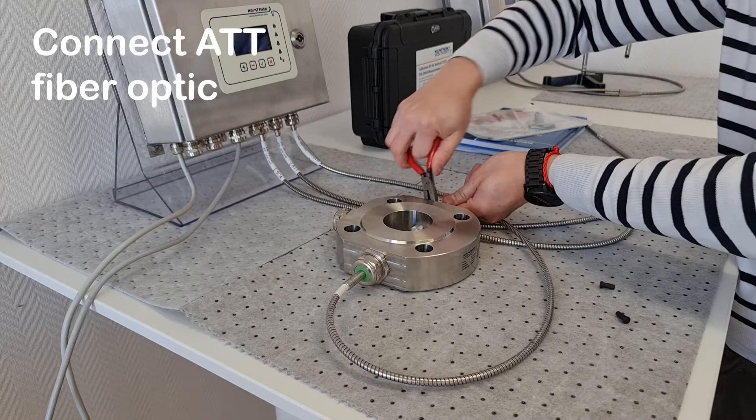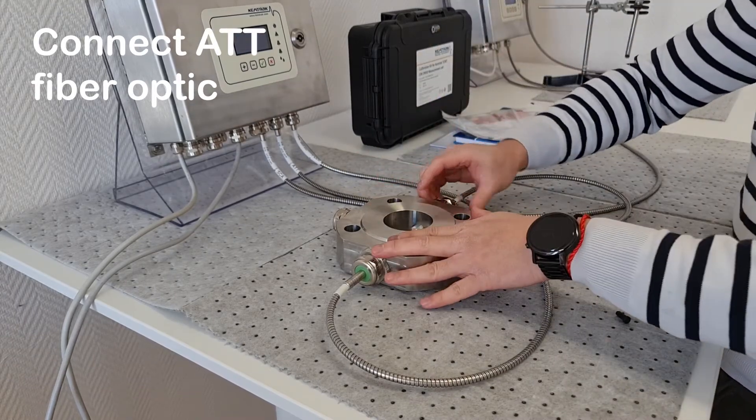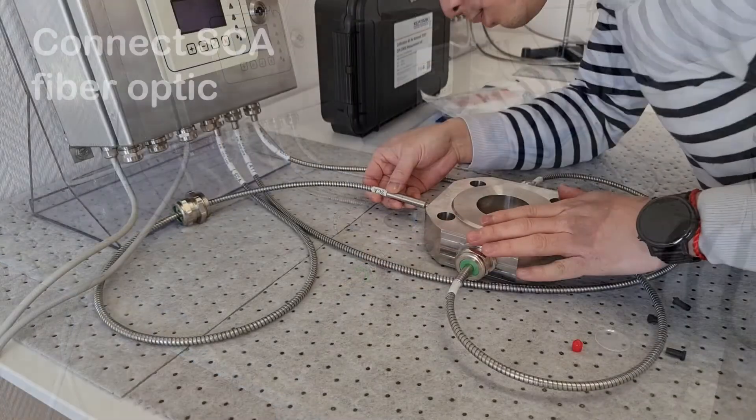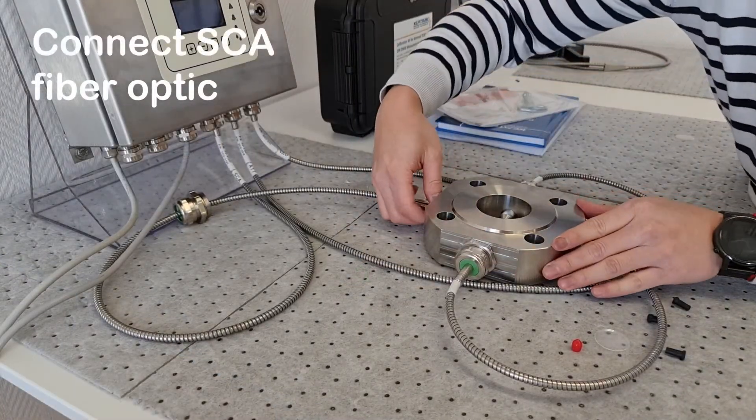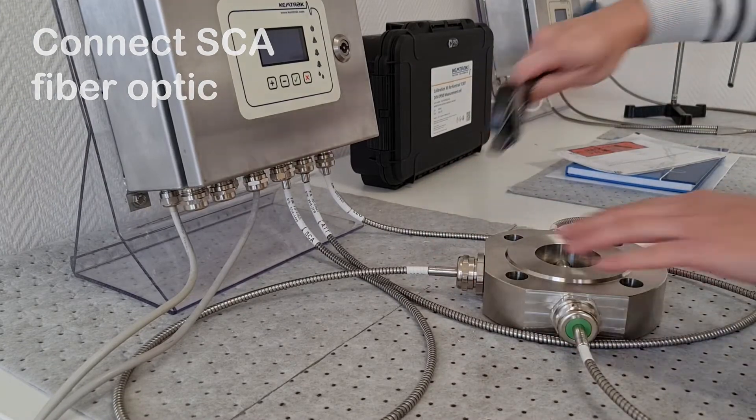The fiber marked ATT should be connected directly opposite to the cable marked LEAD. The fiber marked SCA should be connected to the measurement port located at 90 degrees to the other ports.